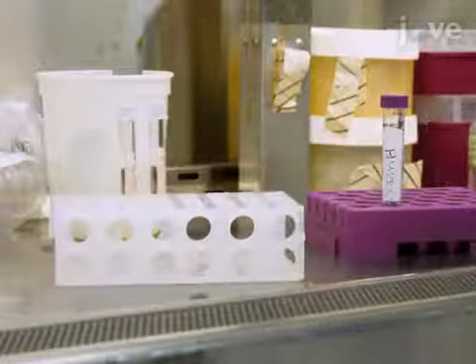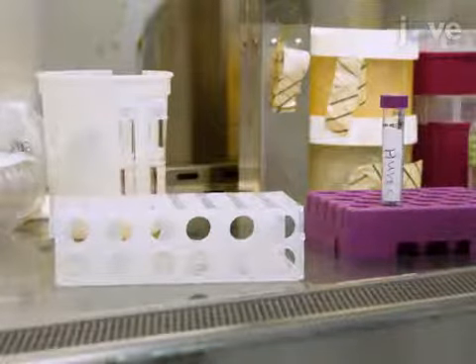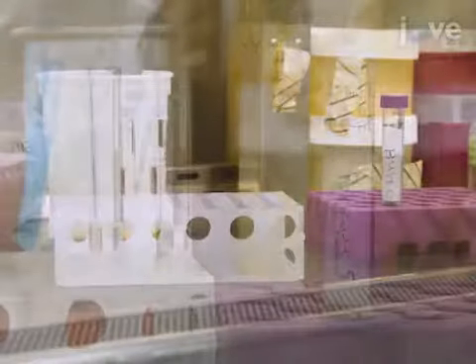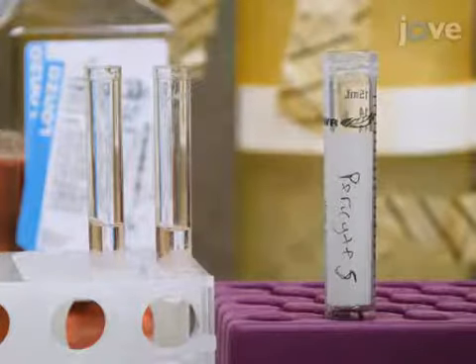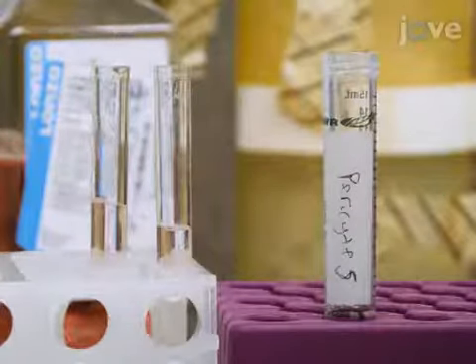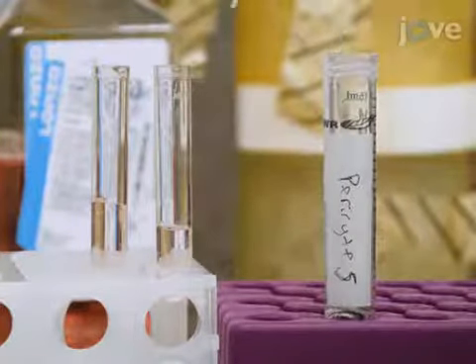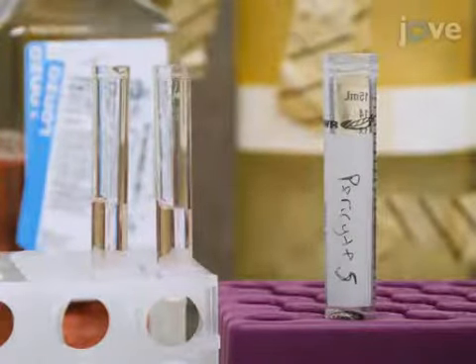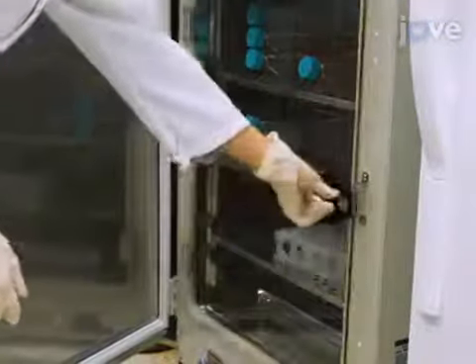At the end of the incubation, rest the cells and beads at room temperature for 5 minutes to allow them to settle to the bottom of the tubes. Then, use a P-1000 pipette to replace 0.5 milliliters of medium from each tube with 2×10⁵ pericytes and 0.5 milliliters of complete medium. Agitate the cell-bead suspension and return the cells to the 37 degrees Celsius incubator with gentle agitation every 20 minutes.